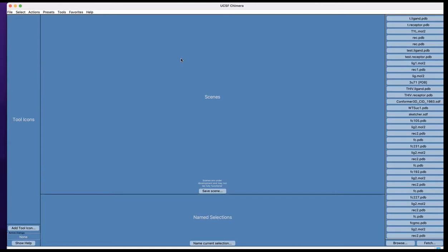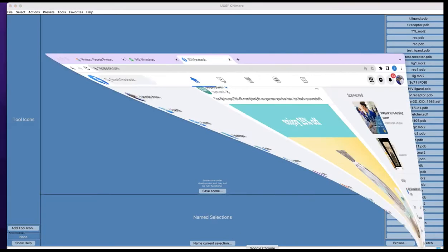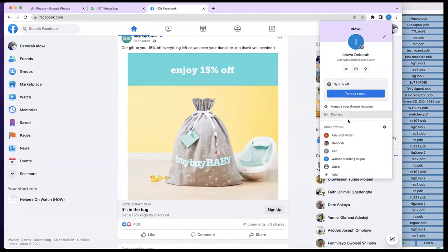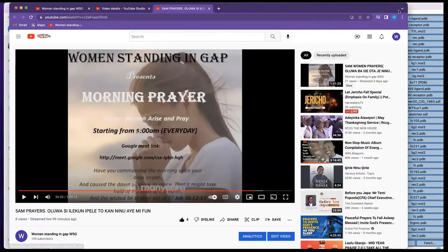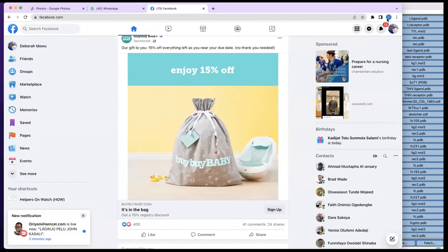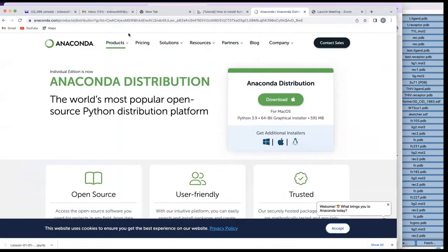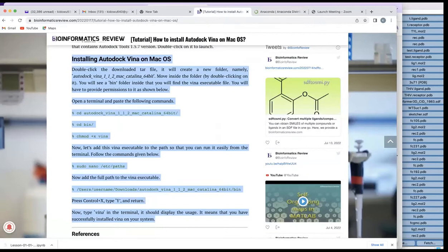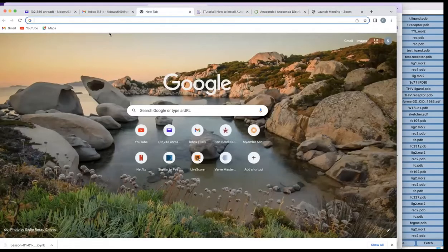But that is not the case with MacBook. For MacBook, you first install Chimera, and after that you need to install AutoDock Vina. To do that, the first thing you need to do is go and download AutoDock Vina — just go to your browser and search for it.